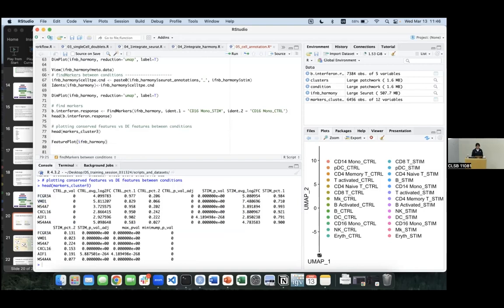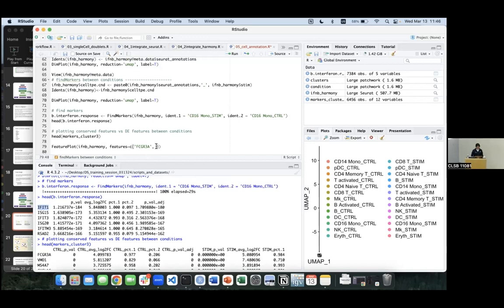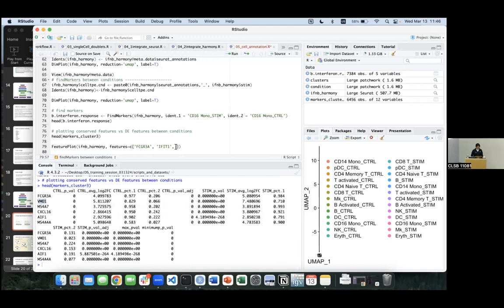You can just play around to see how different genes line up. This one, and what's the final one? We can do this one. Feel free to explore and split by treatment group, and let's set the minimum cutoff again to Q2.